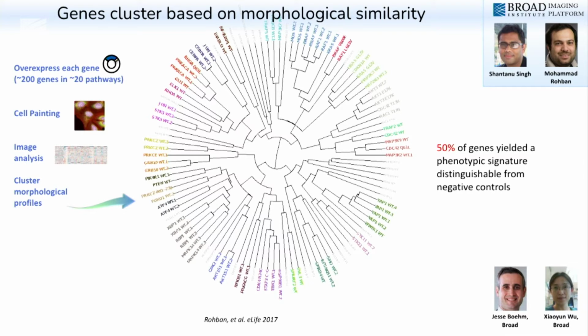So in this first experiment, we were really excited to see that rate, and even more exciting to see that it wasn't like all the genes looked like each other. They fell into really nice clusters, and those clusters had really strong biological meaning. So for example, the hippo pathway is over here, and we found even negative correlations, which was quite surprising to a lot of the biologists and others on the team, that even negative correlations made biological sense.